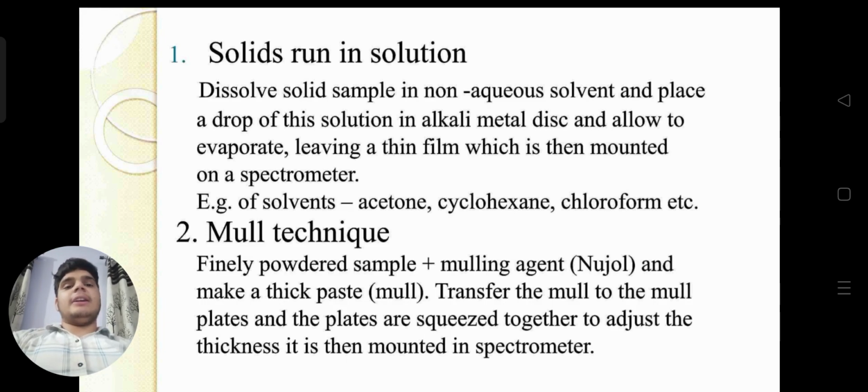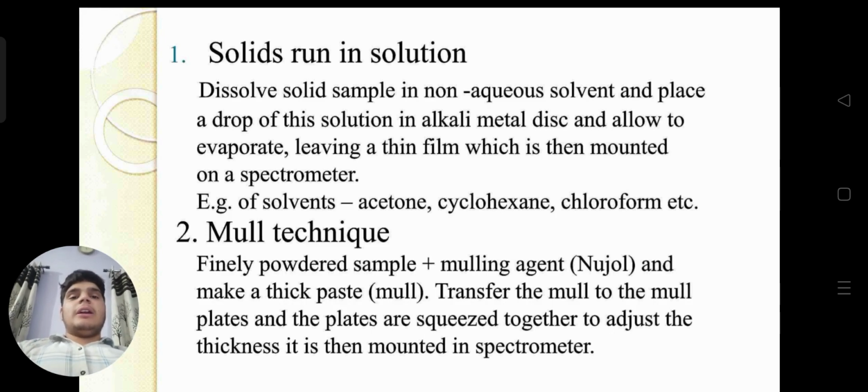Mull technique: a finely powdered sample plus a mulling agent, Nujol, makes a thick paste. Transfer the mull to the mull plates, and the plates are squeezed together to adjust the thickness. It is then mounted on the spectrometer.